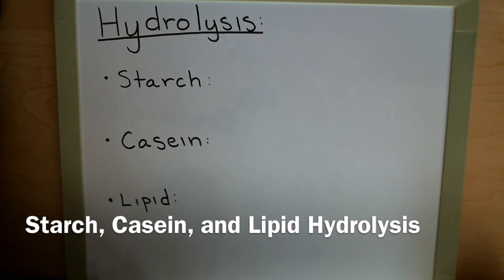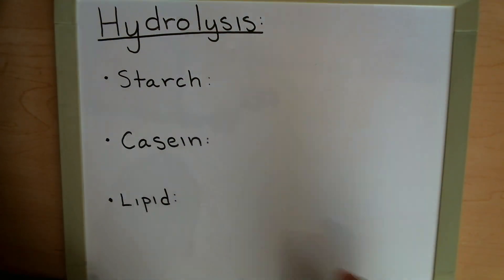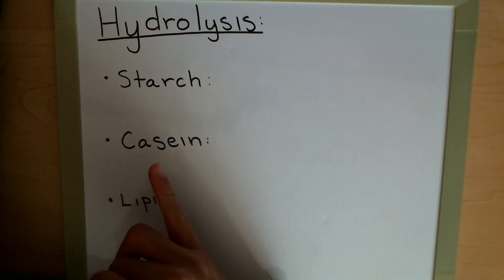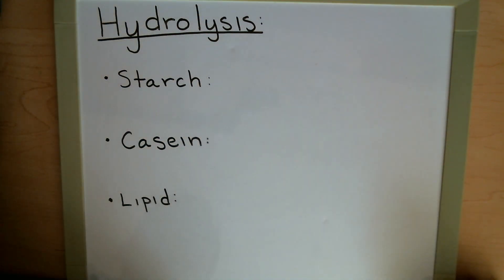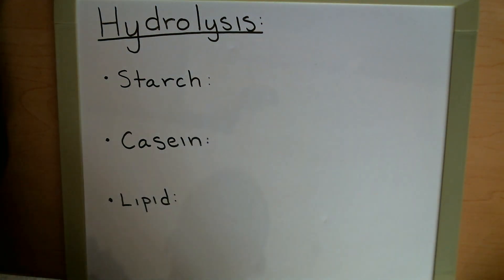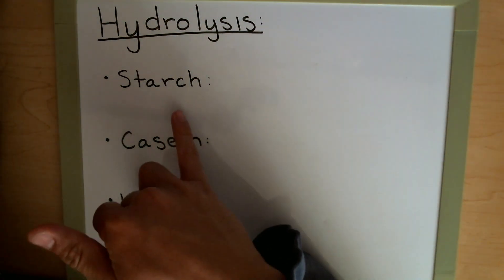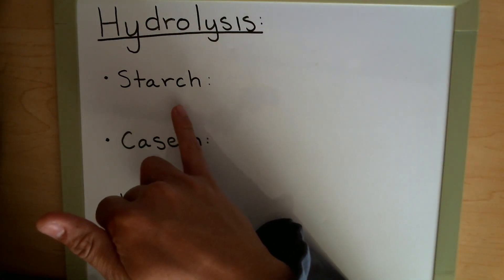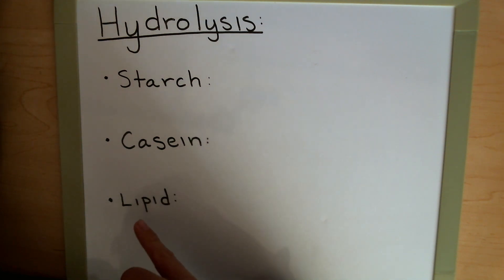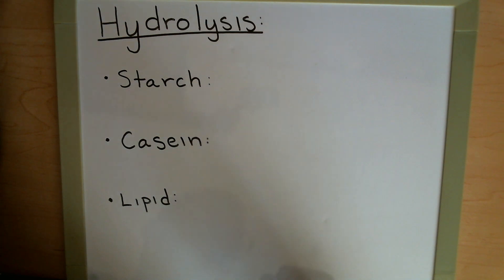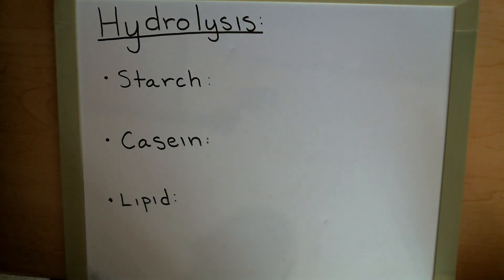In this video we're going to be taking a look at the breakdown of the major energy sources. We have starch, which is the complex form of sugar, casein specifically is the protein found in milk, and lipids for fat. For our starch hydrolysis we're going to be using a starch plate, casein where we have a milk agar, and lipid we're going to be using a tributyrin plate. So with that let's get started.